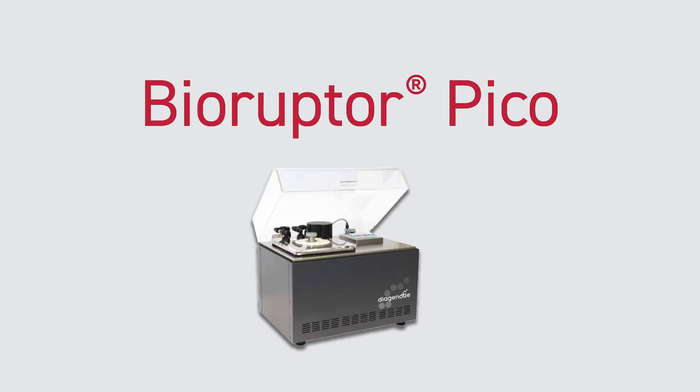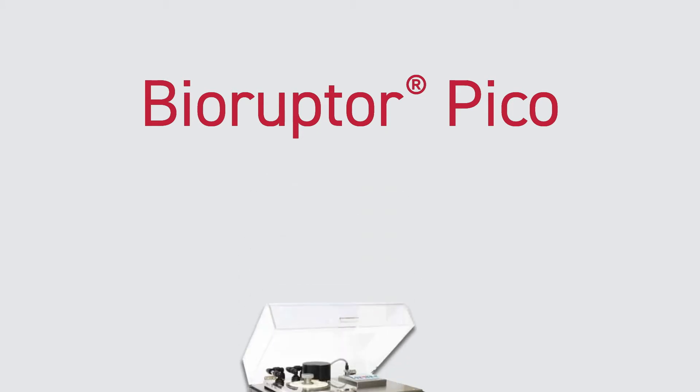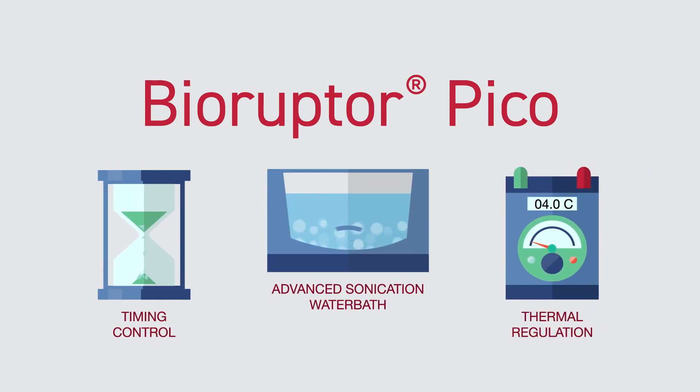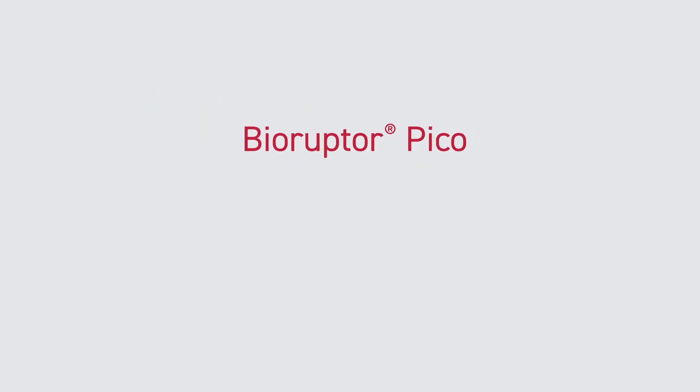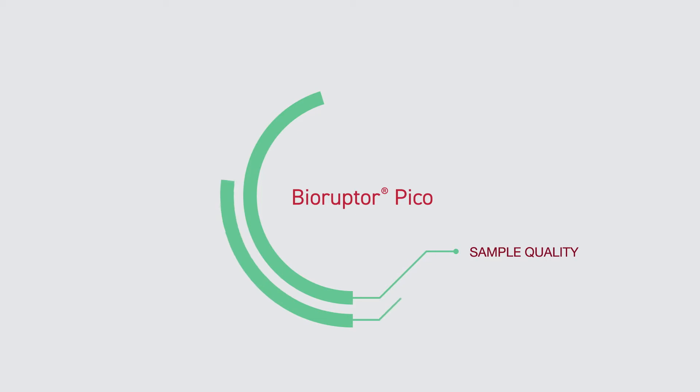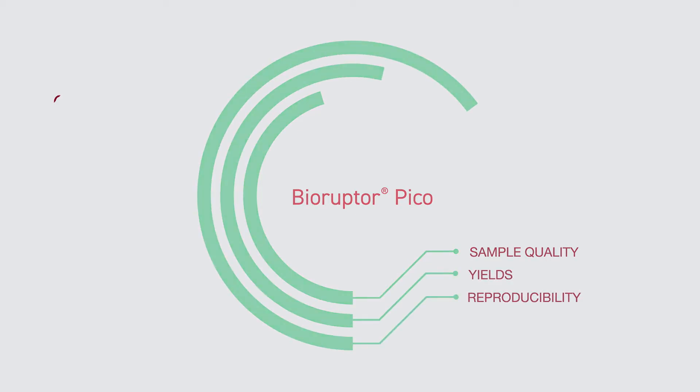Introducing the BioRuptor Pico, the innovative shearing system from Diagenode. With timing control, thermal regulation, and the most advanced ultrasound water bath for homogenous energy distribution, the Pico delivers advanced shearing so you can achieve excellent sample quality, high yields, and reproducibility.